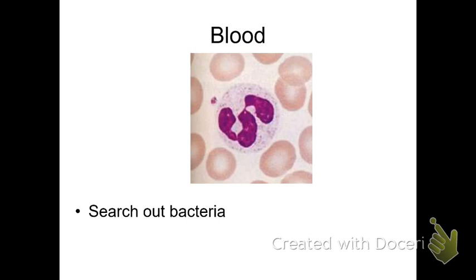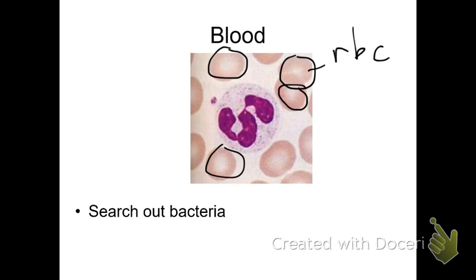And again, you're going to be seeing different views of these tissues between your lab manual, PAL, your lab atlas, etc. So here is a very close-up view of blood. You will not see blood any closer up than this view of blood. And what you have here, let's talk about the cell types, right? These are red blood cells. All these guys are red blood cells, RBCs. And this larger cell in the center is a white blood cell. And what I want you to see is that there's a lot of space in between the cells, right? Lots of space between the cells. So that is that ground substance. Now, blood is unique in that there's a liquid ground substance, right? The space in between the cells is actually a liquid called plasma.